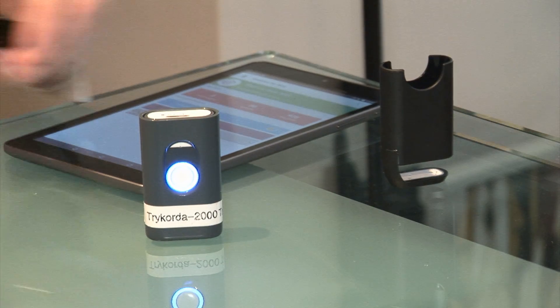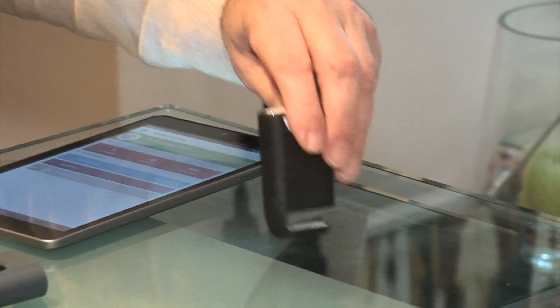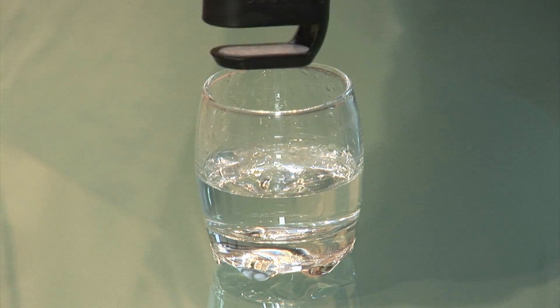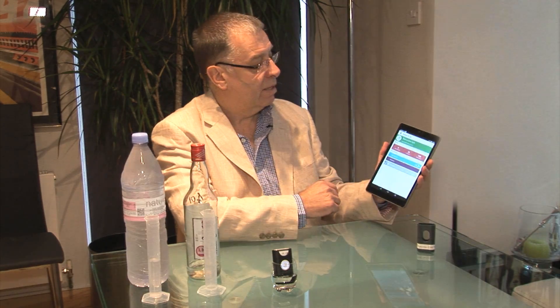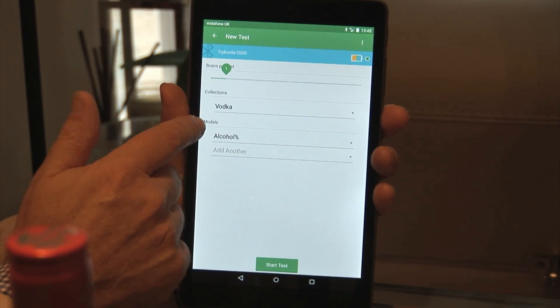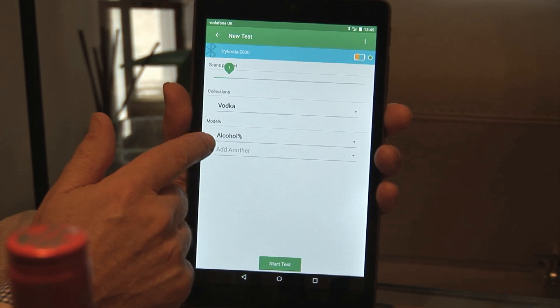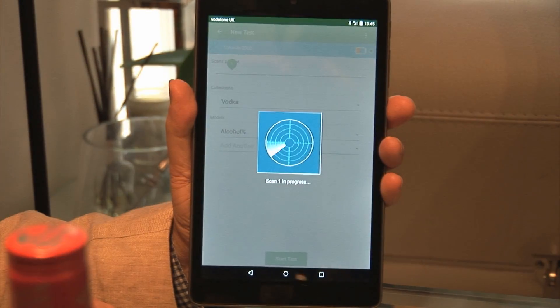Here we have the near-infrared scanner which I will place in the liquid accessory and place that in the sample glass. And then finally we have our tablet running the app. We'll just select one scan and our vodka alcohol model and press the button to start the test.